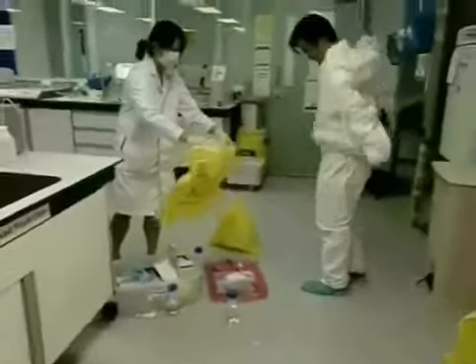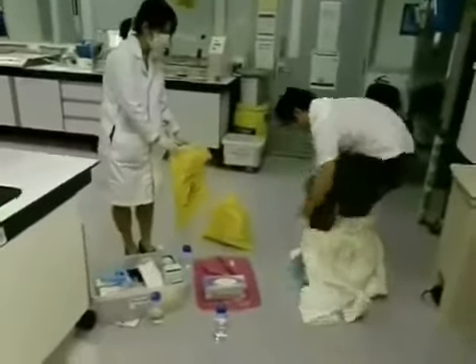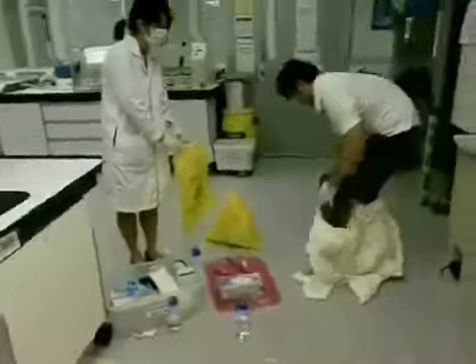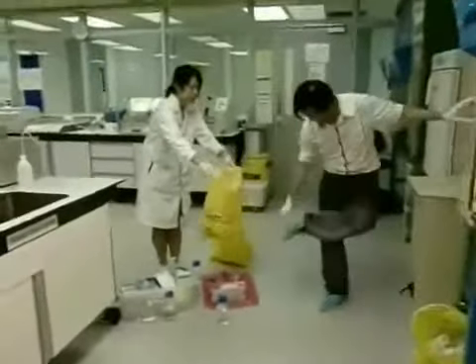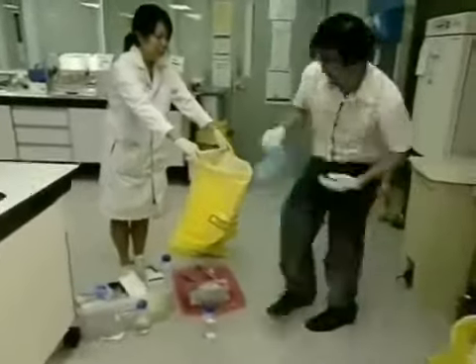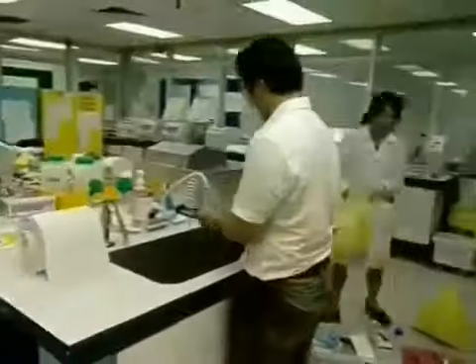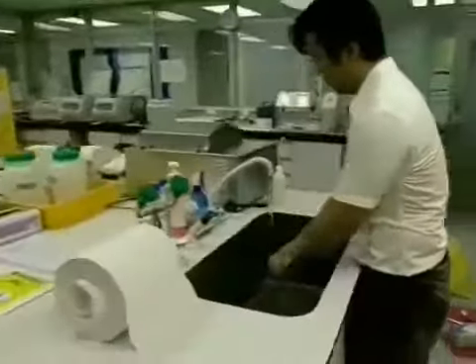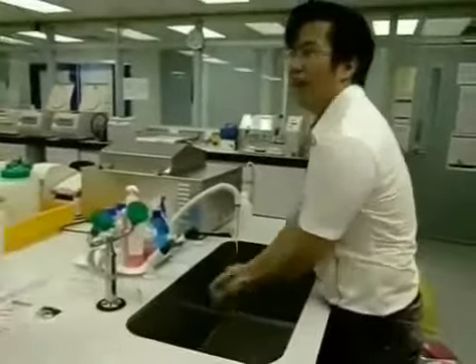Michael, you are removing your PPE in the wrong order. I'm so sorry for your pants — you have touched them with contaminated gloves. You have just touched the instrument with contaminated gloves. Please turn on the tap with your elbow. Michael, please adhere to the proper hand washing steps.